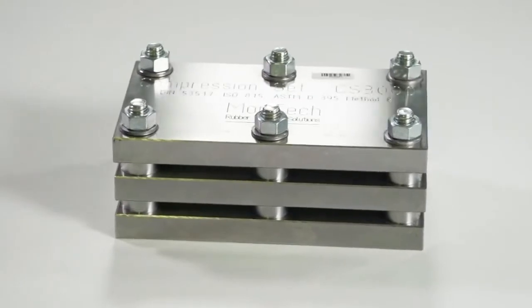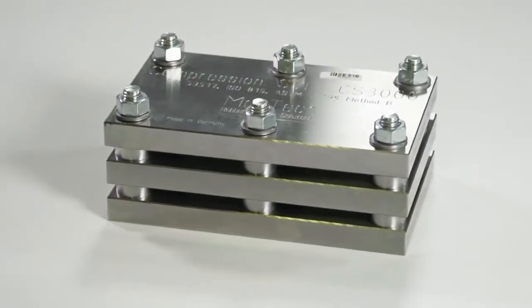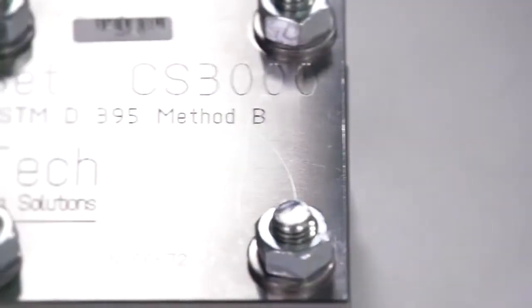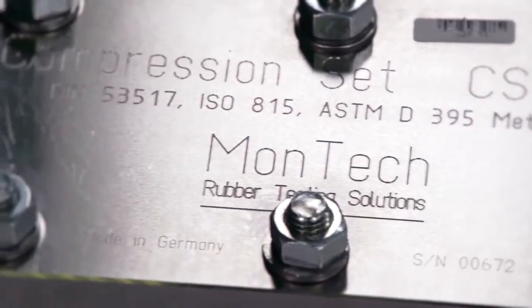Montec's CS3000 Compression Set provides a reliable and repeatable method of testing the effect of compressive stresses on an elastomeric material over a period of time.